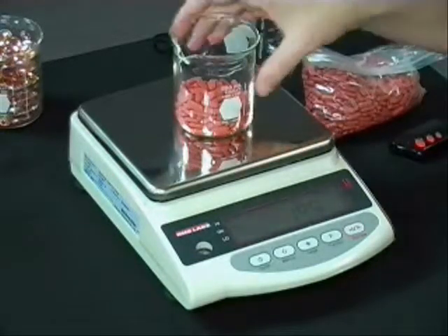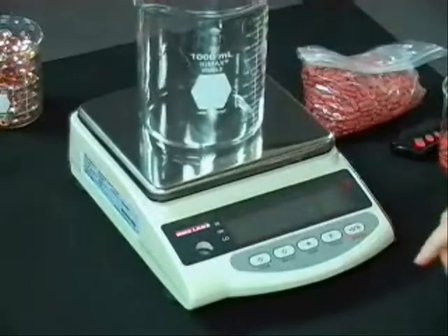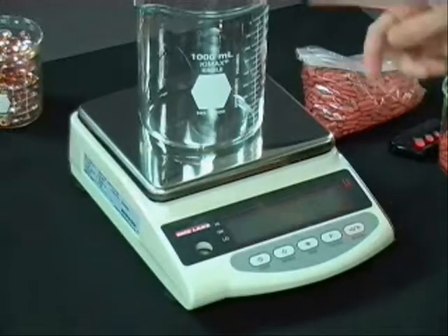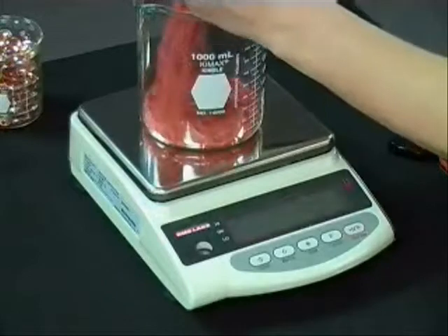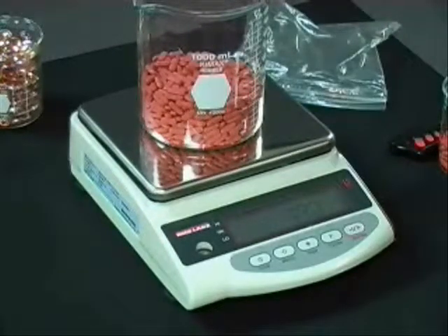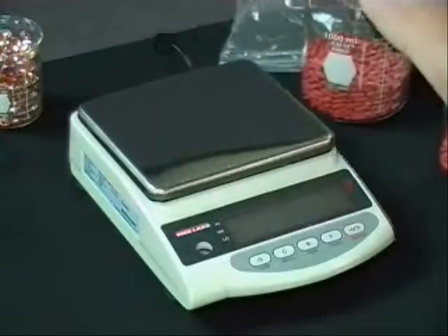If I wanted to change containers and use a different container in my process, all I need to do is push the tare button. It overwrites the tare value and then I can load my new container, which gives me my total weight. And that's how you use the counting mode.